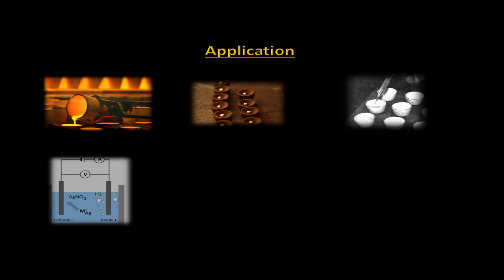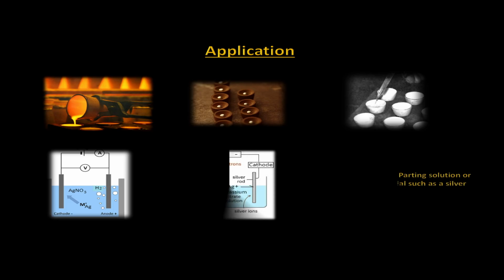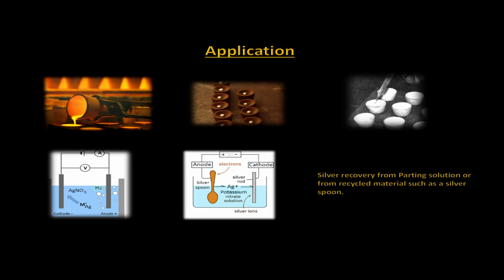Instead of discarding the solution, electrochemical deposition can be used to recover the silver by having it precipitate, that is, deposit on a thin, pure silver wire. Now, to know how much silver was deposited, the wire would have to be weighed first, prior to the deposition. In essence, silver from silver-plated scrap metal can also be recovered.